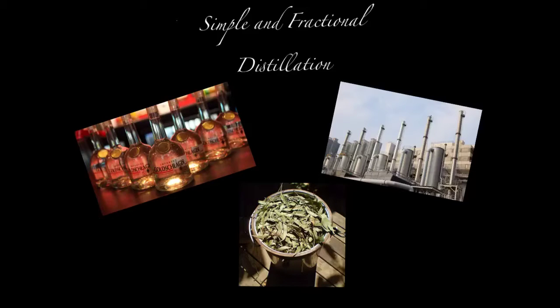So today we're gonna be introducing a separation technique known as distillation. It's an efficient purification technique which is used extensively in different industries to extract compounds from raw materials. Some of the most common applications of distillation are the processing of liquor, the processing of crude oil to obtain usable fossil fuels, and the extraction of medicinal compounds from herbs.